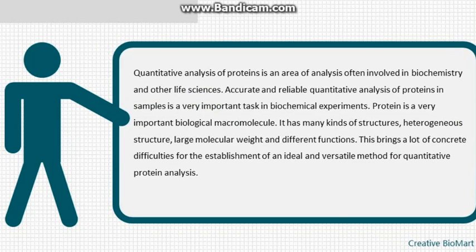Quantitative analysis of proteins is an area of analysis often involved in biochemistry and other life sciences. Accurate and reliable quantitative analysis of proteins in samples is a very important task in biochemical experiments. Protein is a very important biological macromolecule. It has many kinds of structures, heterogeneous structure, large molecular weight and different functions. This brings a lot of concrete difficulties for the establishment of an ideal and versatile method for quantitative protein analysis.